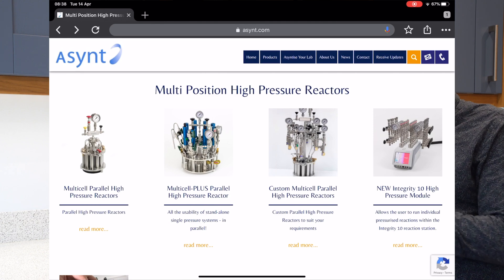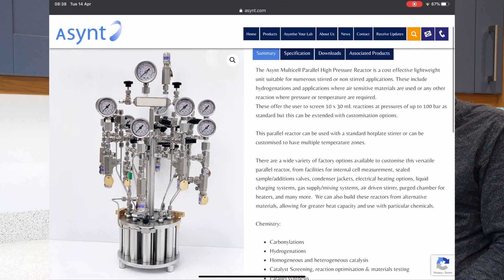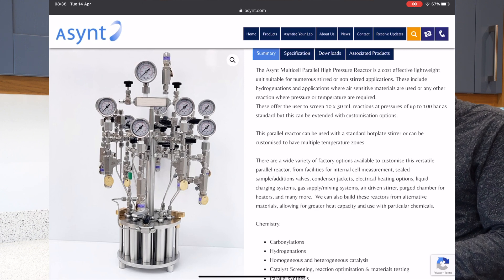For instance, this example is one we built for a UK customer. This particular one has individual pressure control for every position, but the base unit, as you can see at the bottom, is very similar. So that's just one example of what we can do.